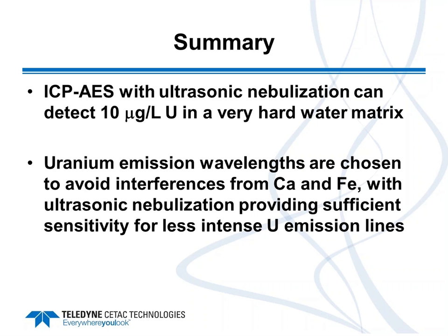When I read it, I was like, what's IVP? You certainly, again, can easily interface the ultrasonic nebulizer to an ICP-MS. Again, you simply are going to use the nebulizer gas from the host ICP-MS to sweep the aerosol to the plasma.